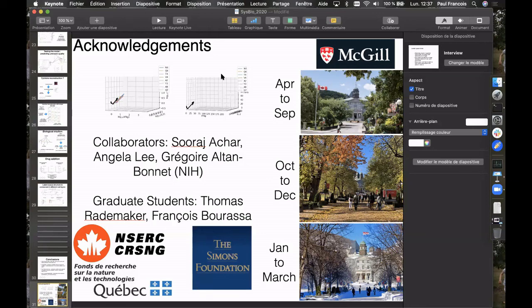We also have other outputs, I have to say. We also have markers at the surface of the cell. We are in the process of using them to see if we can refine the model. But what's very surprising to us, though it's quite preliminary, is that the cytokines essentially contain most of the information. When you add the markers in the loop, you don't really get more.